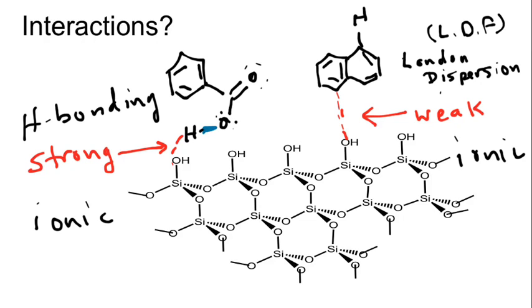So why is any of that relevant? Well, what we have to remember is we go back to what TLC, or chromatography, functioned on. It was looking at a partitioning between two phases, a stationary phase and a mobile phase. Well, we've looked at our stationary phase, so we put our compounds onto it, and now they're stuck. They aren't going to move. The only way they can move is if we somehow bring a mobile phase along. And that's our second phase when we're looking at TLC.